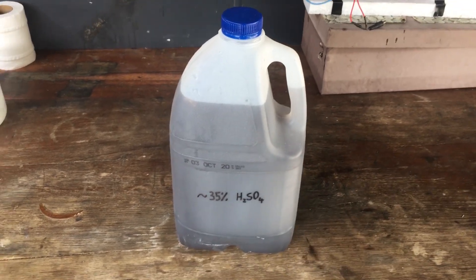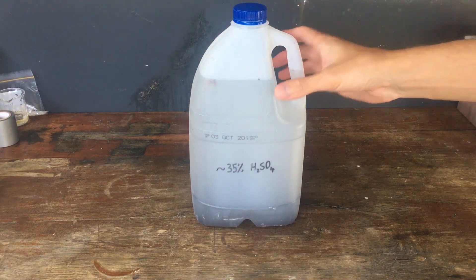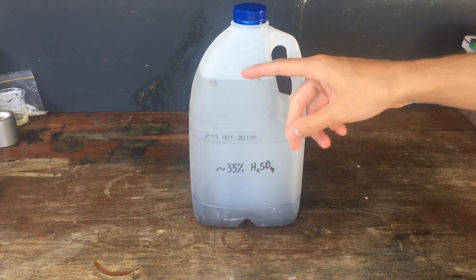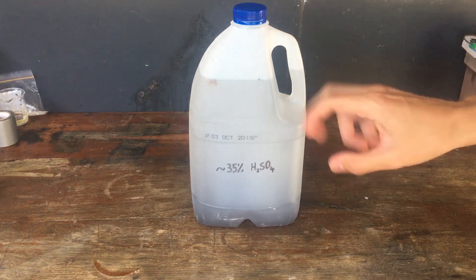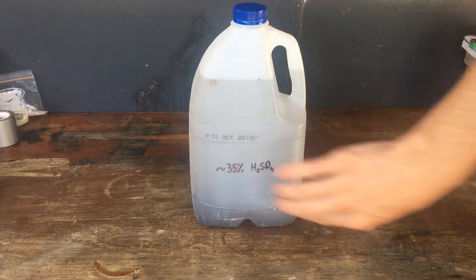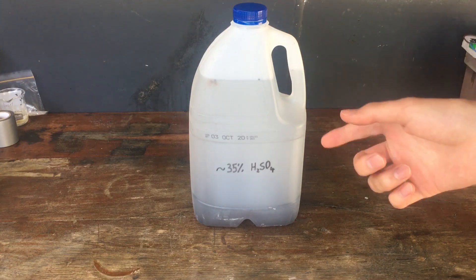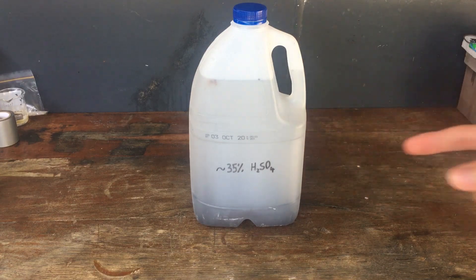We might even have to filter it too. After nearly 24 hours of leaving it to settle, you can see it does look a lot better — all of the lead particles we assume have sunk to the bottom. However, it does still look a little bit murky, especially near the bottom, so I think we are going to have to filter this as best we can, which I wanted to avoid, but we'll do that anyway.